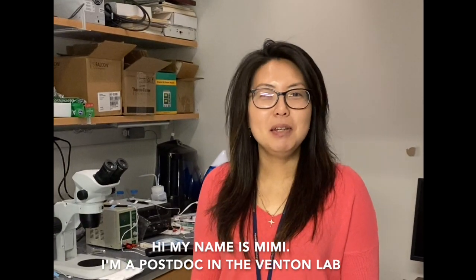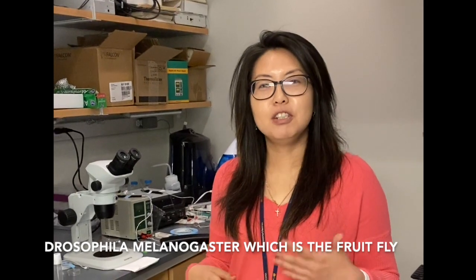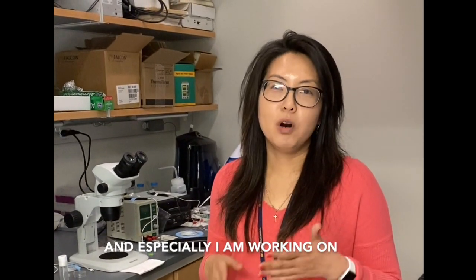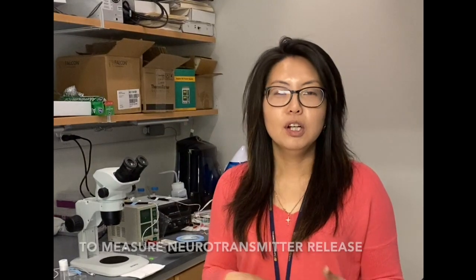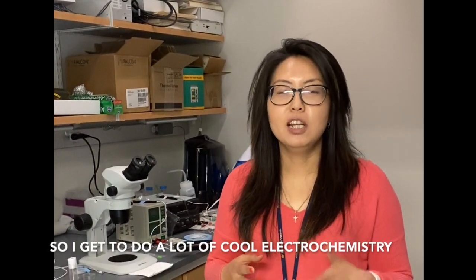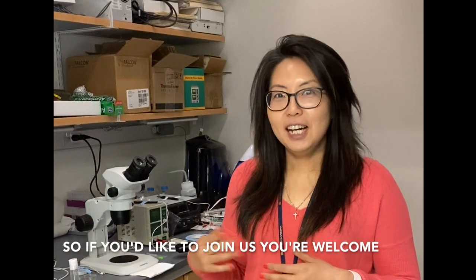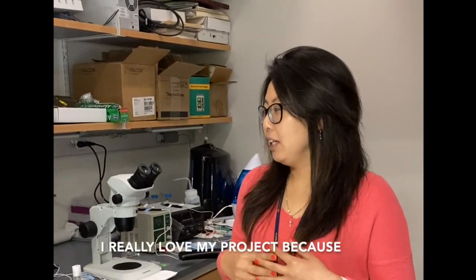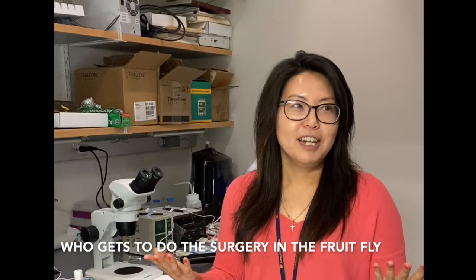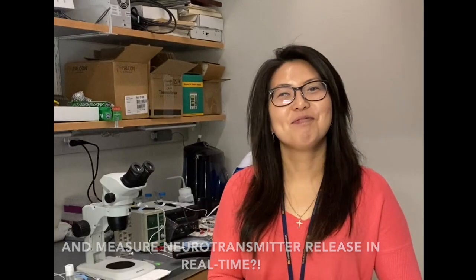Hi, my name is Mimi. I'm a postdoc in Venton Lab. So my main research is focusing on Drosophila melanogaster, which is a fruit fly. And especially I'm working on developing the analytical tool to measure the neurotransmitters released in the Drosophila brain in adult flies mainly. So I get to do a lot of cool electrochemistry and imaging and surgery in that tiny Drosophila fruit fly brain. So if you'd like to join us, you're welcome. I really love my project because who gets to do the surgery on the fruit fly and measure the neurotransmitter release in real time.